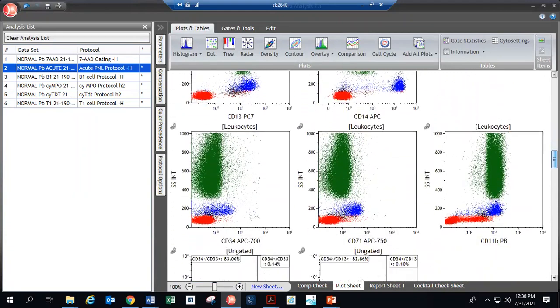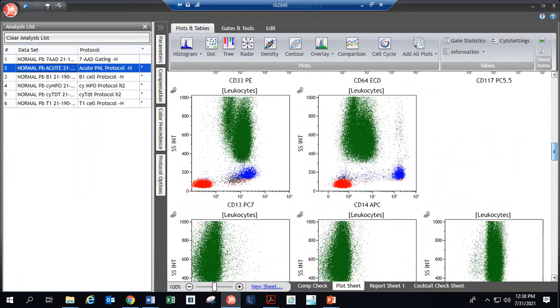Like here in this plot, they're kind of making two columns. When you see CD13, if you remember, there is one stage in the maturation of granulocytes, like promyelocytes, and the rest of them are metamyelocytes and neutrophils. That's what it is. And you won't see side scatter versus CD13 or anything if you're signing out regularly. Like Akanksha said, these are much more detailed because this is probably their SOP, so they have everything in there. But you won't see side scatter versus all these, so don't worry about it. Okay, good. Thank you.